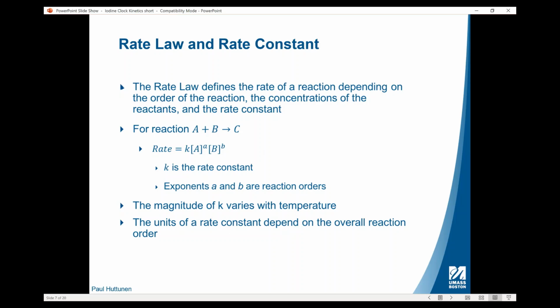Okay, so once we know how much has been consumed, we will be timing from the point where we add the reactants together until we see the brown color appear. So we will be measuring a time, and we will have a known concentration based on the thiosulfate. So we will be able to calculate the rate of the reaction.